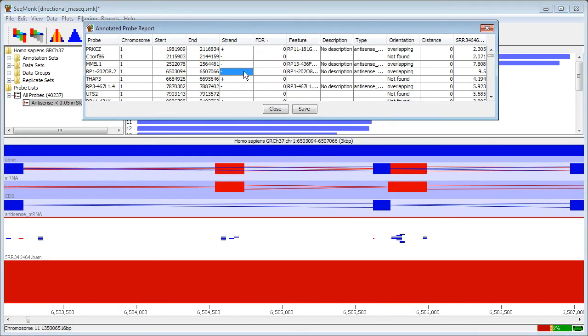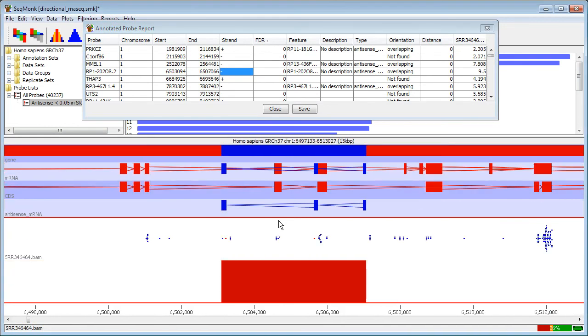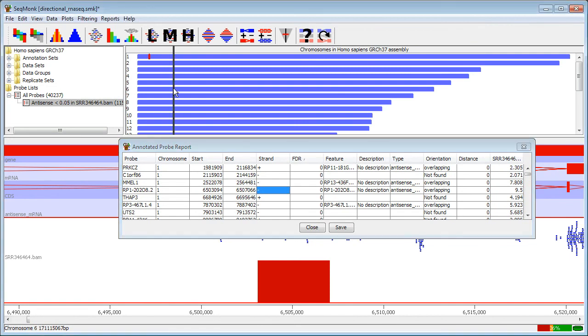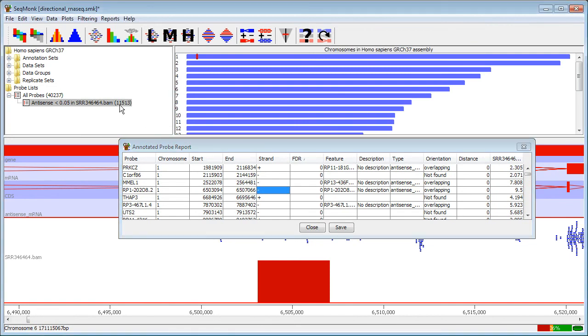So in one simple step I've identified a number of regions in the genome where the annotated genes are in the incorrect direction given where the majority of reads from the RNA-seq actually sit. In one step I can therefore identify a full set of candidates, in this case of around 11,000 genes, where there is a significant level of antisense transcription occurring within my sample.